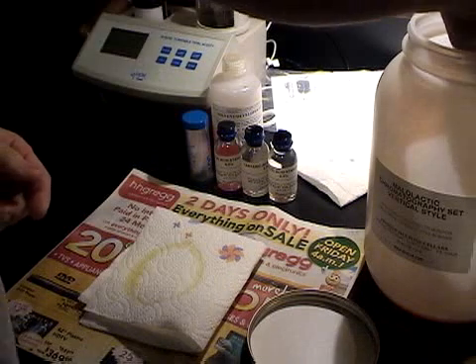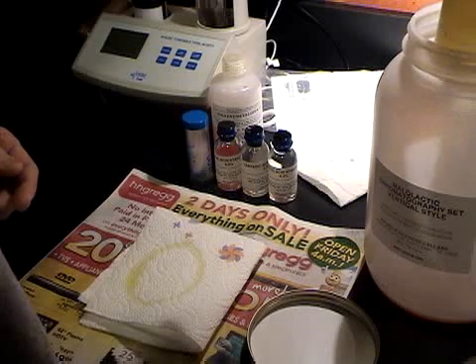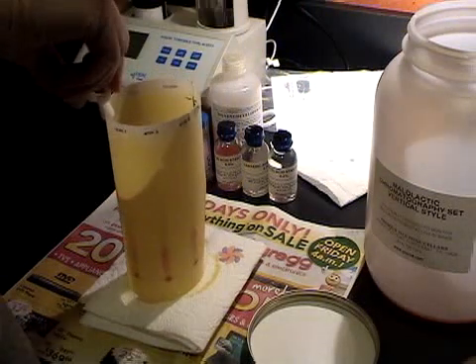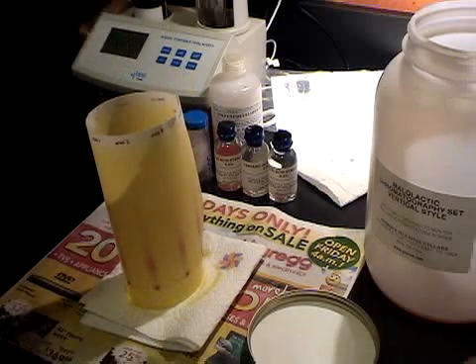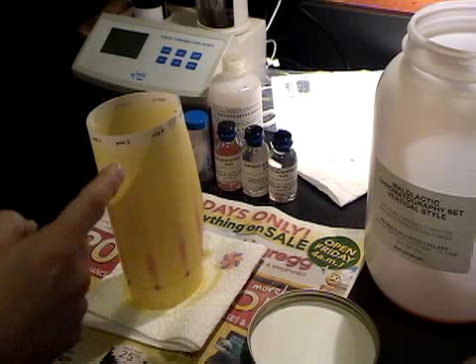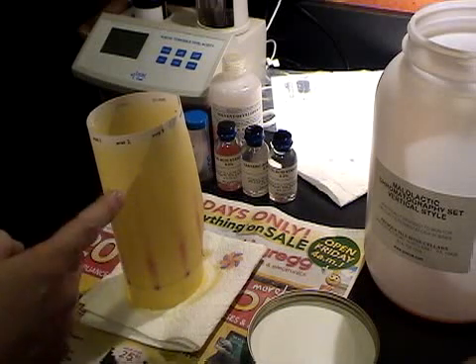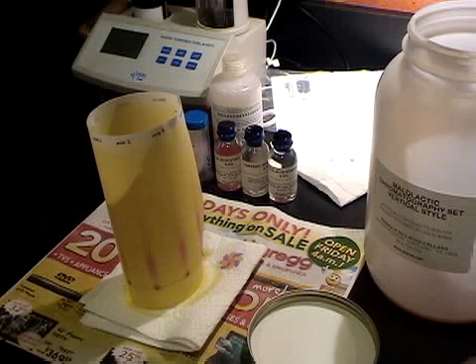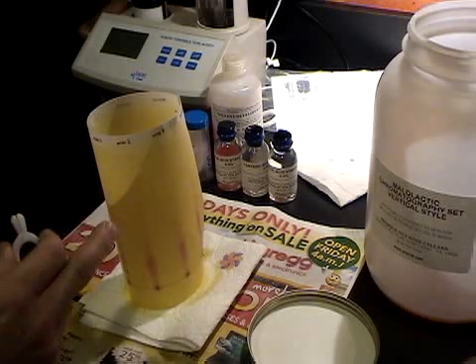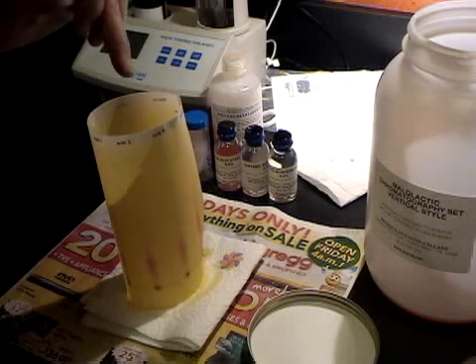After six to eight hours we'll take the paper out of the developer and we need to hang it to dry. You'll see that it's already started raising up the wine sample through capillary action. Apparently when this dries we will get a visible trace of the various acids in the paper. We'll hang this up and then we'll visit it again soon.